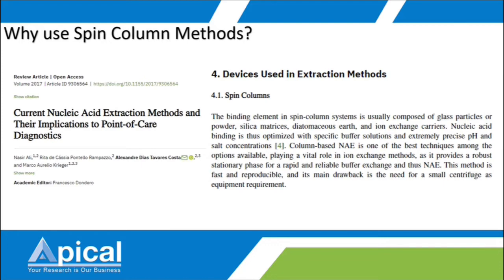In this review, it stated that column-based nucleic acid extraction is one of the best techniques among the options available, playing a vital role in ion exchange methods. It provides a robust stationary phase for rapid and reliable buffer exchange, so it helps in nucleic acid extraction.